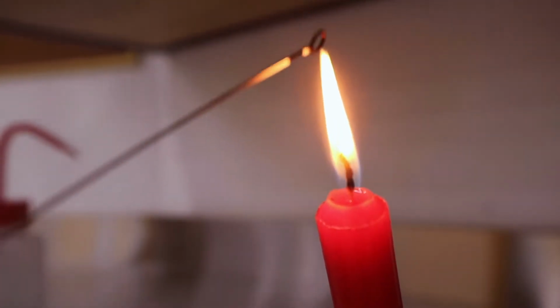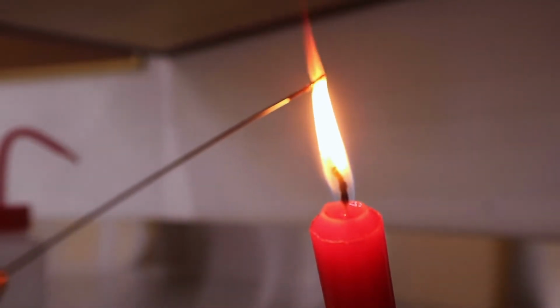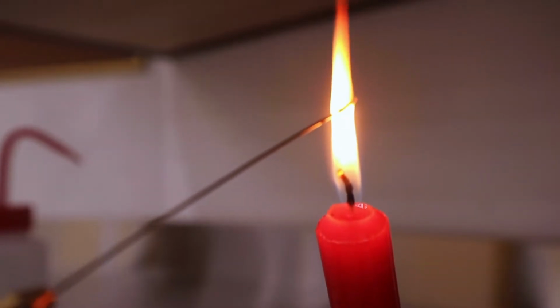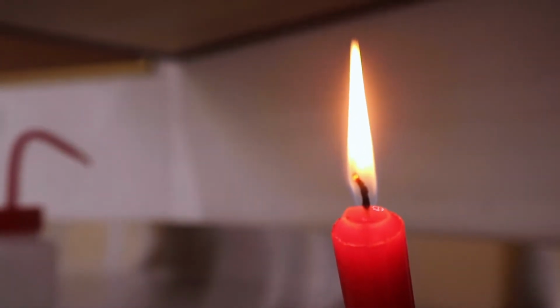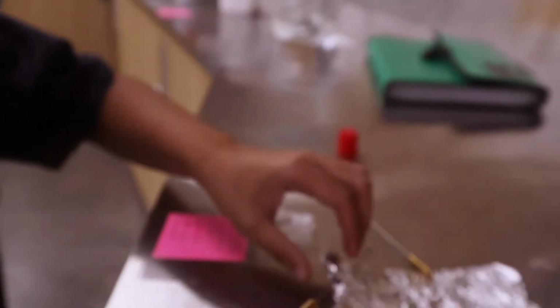And wait until it turns red. Can you see it turning red? Is it red? Yeah, it's starting to get red. You can see? Is it red? Oh, it's very red. And it's black. Why is it black though? I think it's the paraffin. I think it's the carbon that is on this.